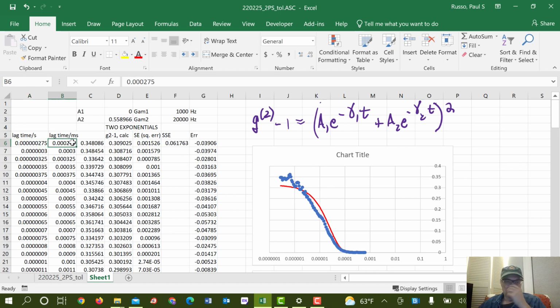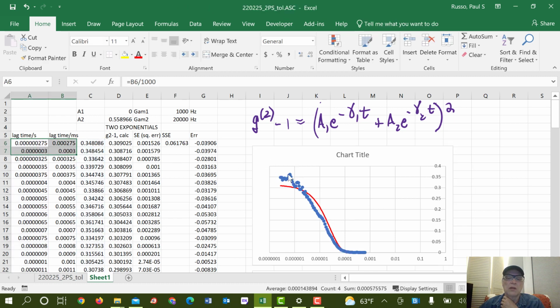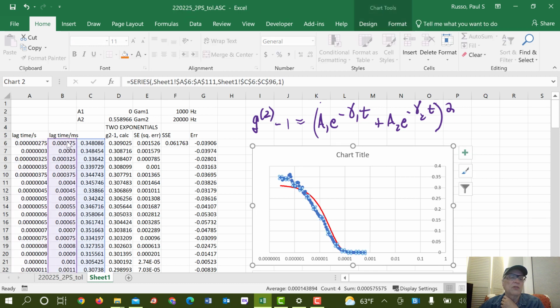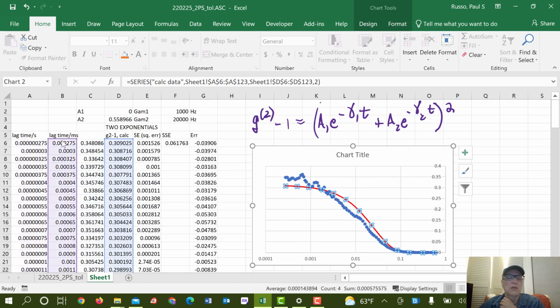And you'd have to code these things yourself or do a grid search type of thing instead of a gradient search to find out. I think I'll push ahead and just see what that would look like. Let's just move the x-axis to be, oh, come on. Move the x-axis to be that guy instead. And we'll do the same for the fit. Okay. And then our decay times all have to be something else, I guess.